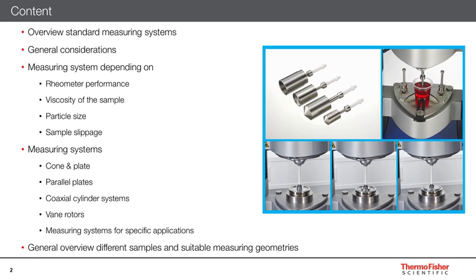After talking about the details of the different measuring systems, I will close this webinar with a general overview of different types of samples and the most suitable measuring geometries for testing them.